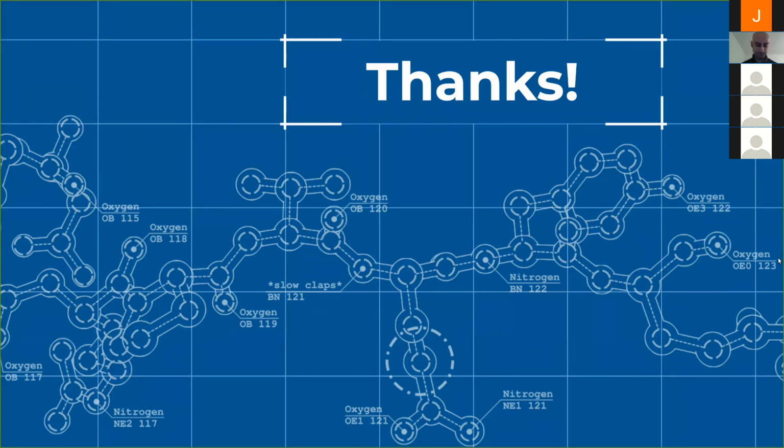Hi, thanks so much for this talk. I had a question kind of in the middle of the talk, so I think you've addressed some of it, but I was just curious, can you talk a little bit more about what exactly the training data set is? Is it two-dimensional images, or is it the three-dimensional structures? In the case where it's the three-dimensional structures, I'm kind of interested how you detect artifacts when you introduce overly strong priors into the reconstruction.